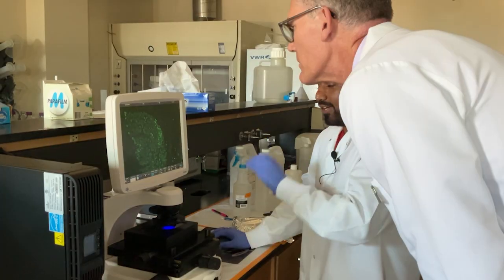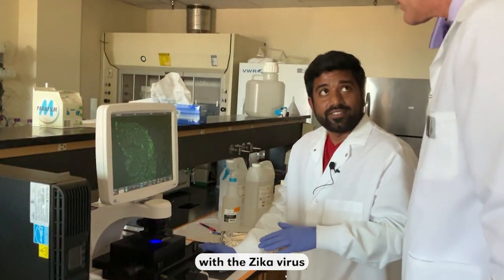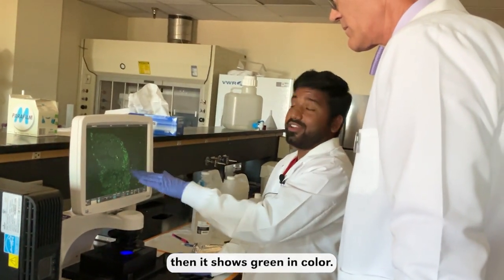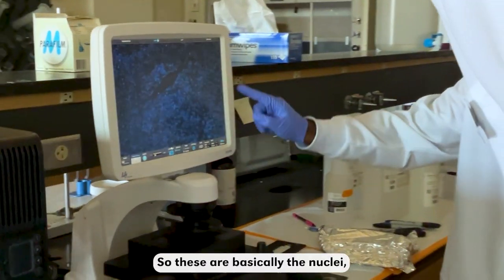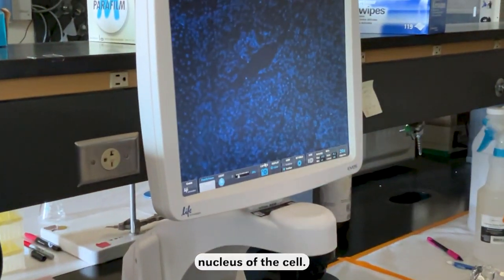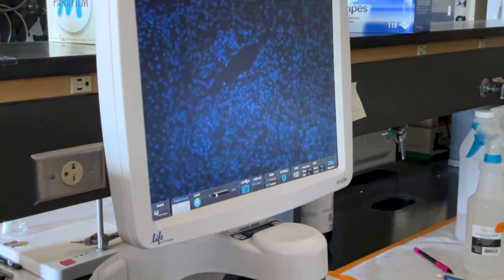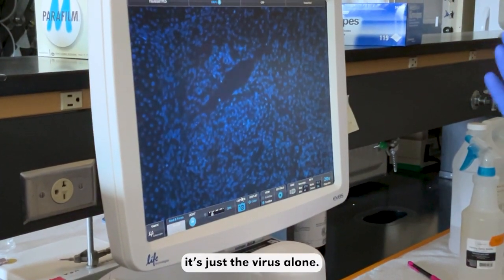Yes. If the brain is infected with the Zika virus, then it shows green in color. The bright colors. So these are basically the nuclei of the cell. The previous image I showed you was just the virus alone.